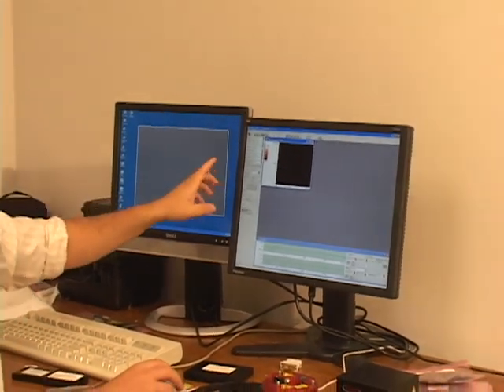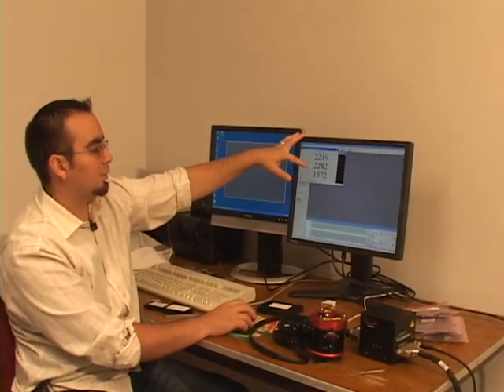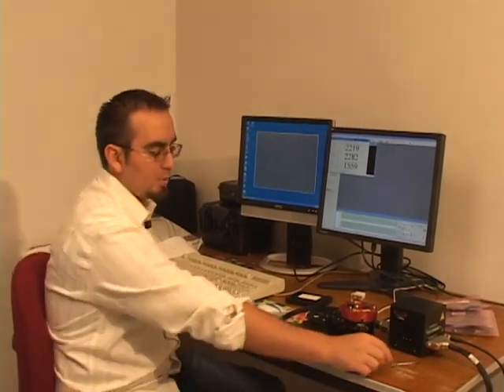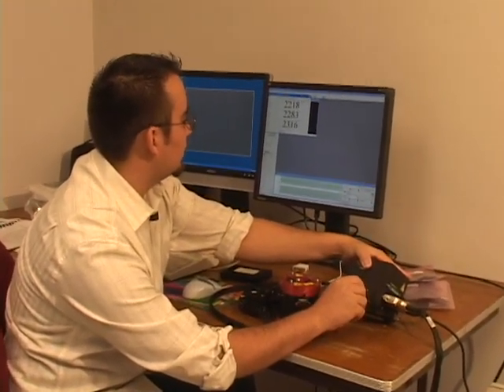All right, so we did X and Y, now let's balance out Z. So go to Setup, XY alignment, again. It's reading 1.5 volts. We want to read that as close to 0 as possible. So again, we go on the brick and adjust that till it reads out 0.